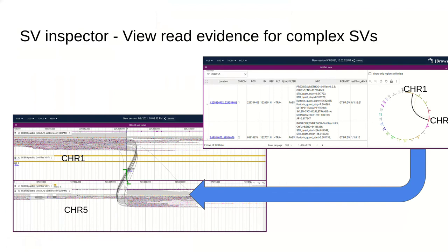We also have a special feature in JBrowse2 that we call the SV Inspector. This shows a table of structural variants along with a circular whole genome overview. In this example, it's connecting chromosome 1 and chromosome 5. And when you click on this, it brings up a detail view that can let you show the read evidence that connects those two points, shown by the black curvy lines.